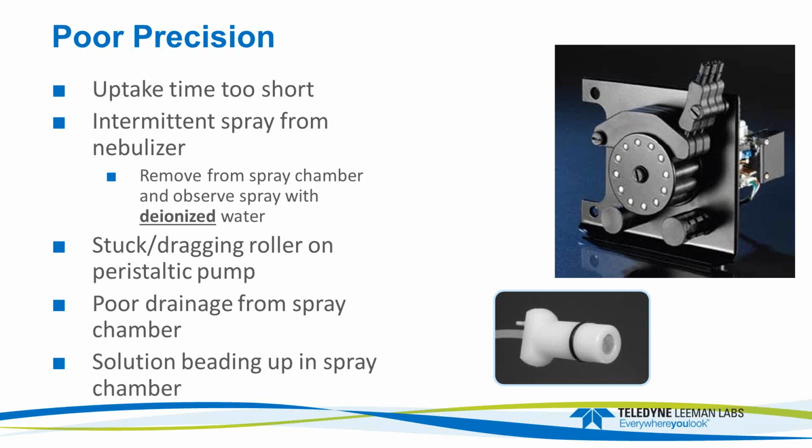Usually, at that point, I may actually let the nebulizer run, and I'll adjust the tension on that peristaltic pump. I tend to not put a lot of back pressure on there. I like a nice smooth aerosol coming off. If you tighten it up a little bit, there might be a little bit of pulsation. The longer integration time will generally cover that for you, so you don't have to worry about it. But you really want to make sure, like in that nebulizer QC that failed, the nebulizer that I had there was just a bad neb, and there's no saving it. The spray was just terrible.